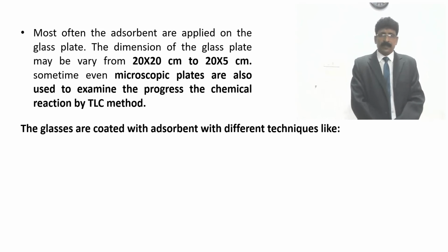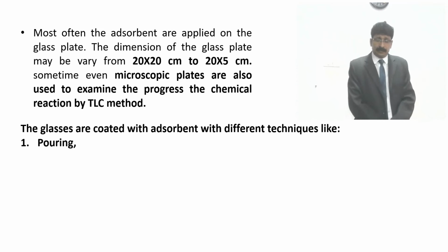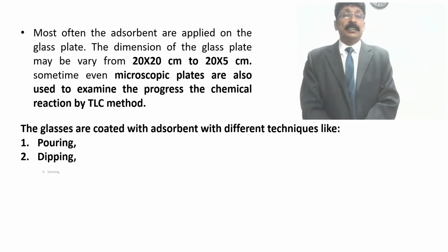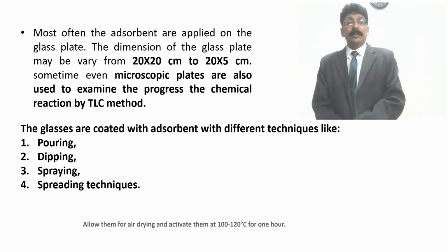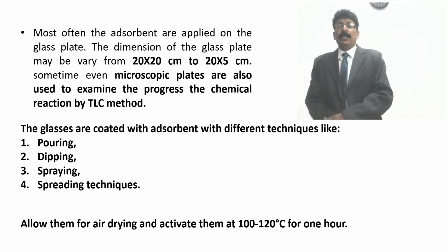The glass plates are coated with adsorbent by different techniques like the pouring technique and the dipping technique, where a slurry is made and you dip the slides and take a thin layer. Spraying can also be done, and the spreading technique with a glass rod can also be done. There is also an instrument with a spreader available for the glass plate of the TLC plate.